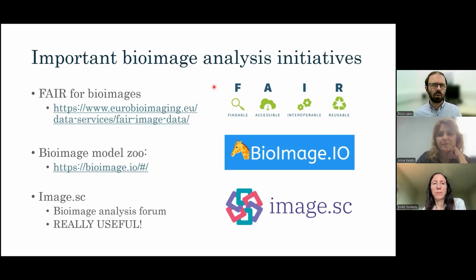And also, sometimes, people will use it for tissue at a similar scale to what we would do volume EM. And it's often when they want to look at the tissue as close to its native state as possible, but you don't get as good contrast with it generally. It's quite hard to do. I can't really speak to it because we don't have a cryo FibSem system here, which would have the sample frozen and then milled away by what's called a focused ion beam gun. That's the other technique for volume EM. So I can't speak so much as to why people go for that as opposed to volume EM.